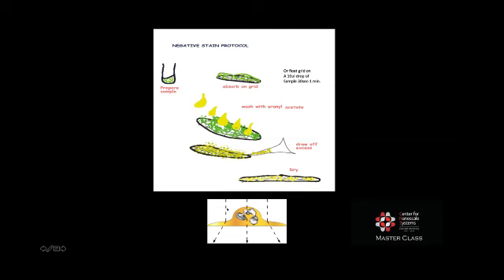Now what we have achieved again is your material is actually embedded in the stain. Now there are as many protocols for negative staining as there really are people doing negative staining. But this is a protocol that I've been working with for many years, and it's pretty fail-safe. The thing you might change would be drying your sample on the grid before staining, but that's really the only way that you might change the appearance of your sample.